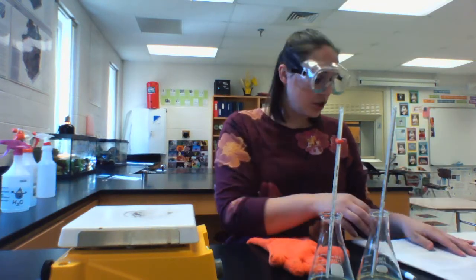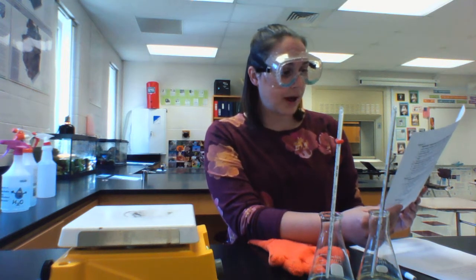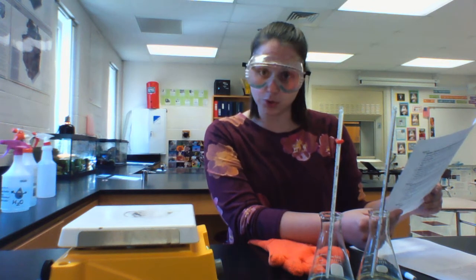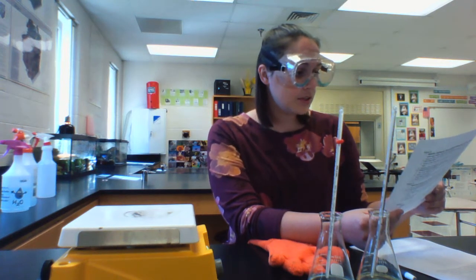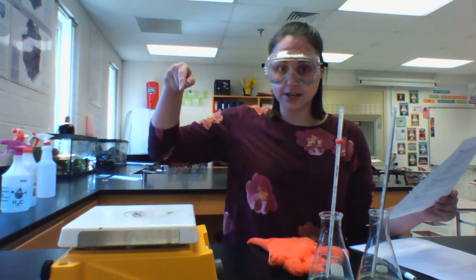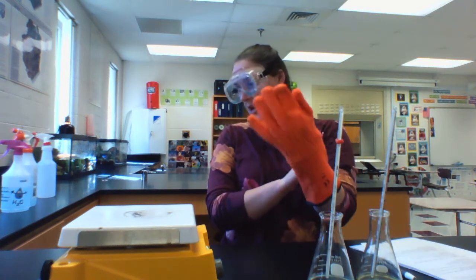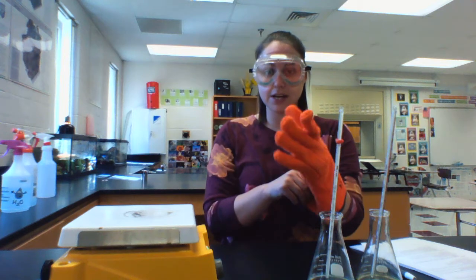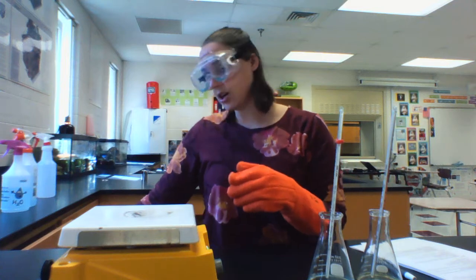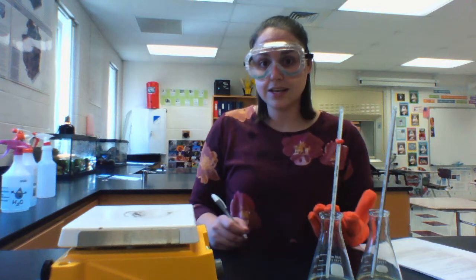For the procedure, because I've already measured out my water and my oil and put them in the Erlenmeyer flasks and used a thermometer to discover the temperature of both of these flasks, I'm now going to place both flasks next to each other on a hot plate, which is here. It's hot, so I'm going to be careful, and I'm going to put on a glove to protect my skin from heat. And I'm going to place these Erlenmeyer flasks onto this heated hot plate.